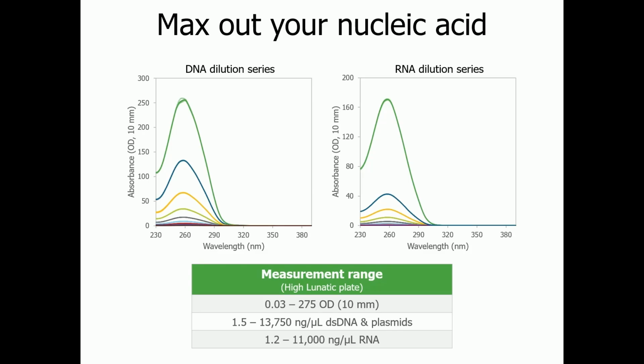If you're measuring things that are very high concentration, a High Lunatic plate's more appropriate. But if you're measuring things of a more moderate concentration, it might be that the regular Lunatic plates are more appropriate.